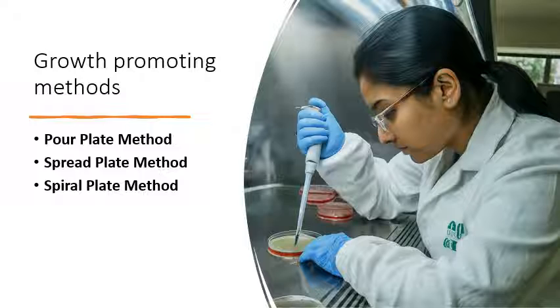You must avoid bubbles while mixing this agar together, because you have to do it gently. If there's any case of bubbles, once it's solidified, it can alter the view of the agar or even the result. So the agar is now allowed to solidify after 20 minutes.